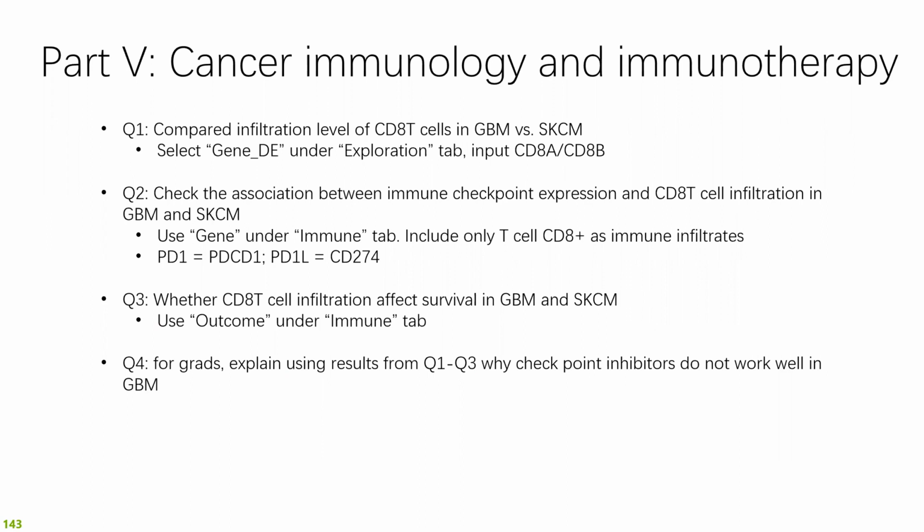A note here is that for PD-1, you should include PDCD1 because TIMER uses a different name for it. And for PD-L1, it's CD274.